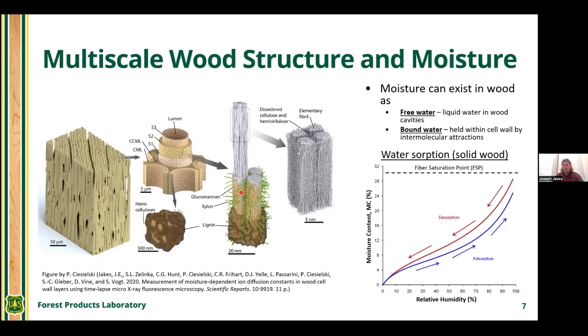And I'll show later how we actually build humidity chambers in the synchrotron beam lines to actually study these properties over different levels of moisture content. And then once you get above the fiber saturation point, that's when you start to get free water forming in wood.